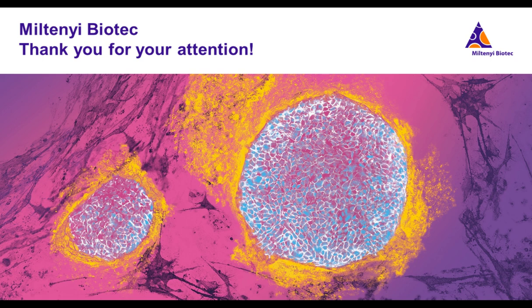You can simply use any kind of antibody you have and generate a conjugate out of it, and that's it. Now, how long does a staining and imaging cycle take on average? Multiple factors contribute to the cycle time.